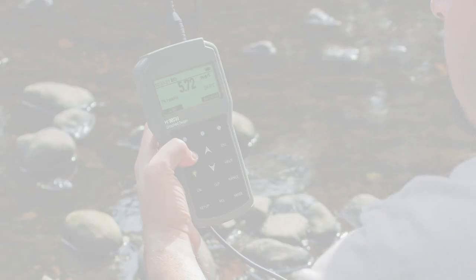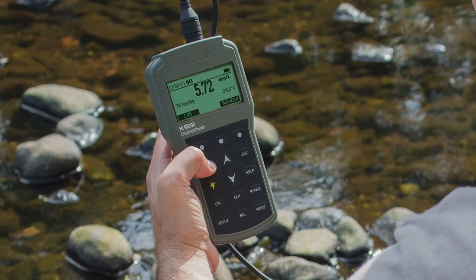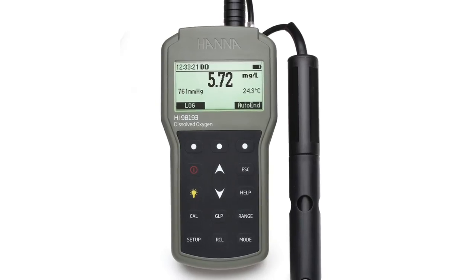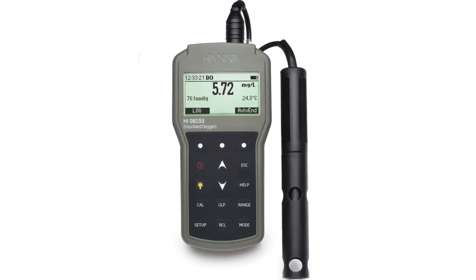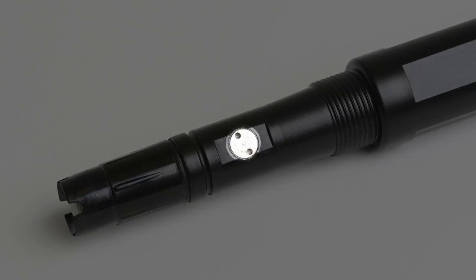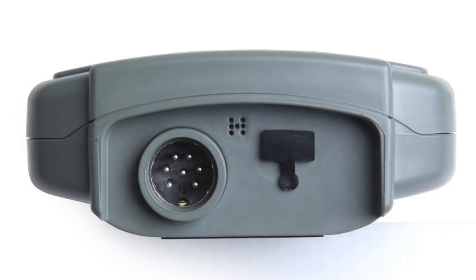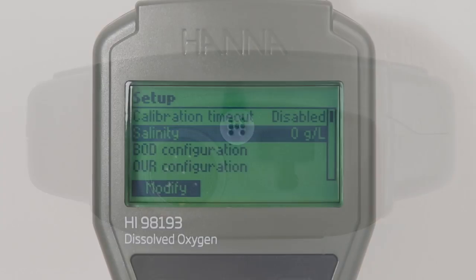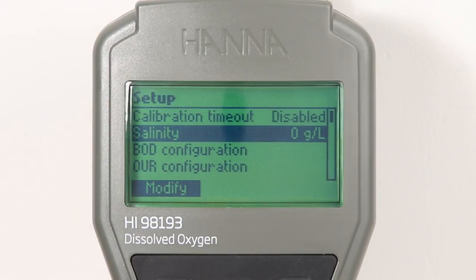Dissolved oxygen measurements are affected by a variety of external factors including temperature, pressure, and salinity. The HI-98193 allows the user to automatically compensate for these external factors, starting with the use of the integrated temperature sensor on the probe. The meter itself features an internal barometer which permits the user to automatically compensate for pressure. Furthermore, the salinity of the sample can be input by the user in order to enable salinity compensation.